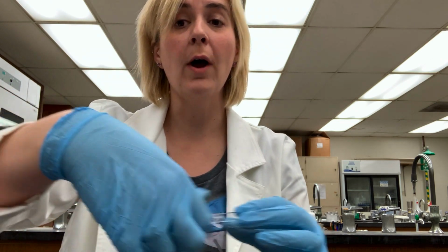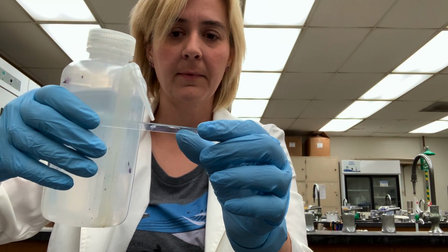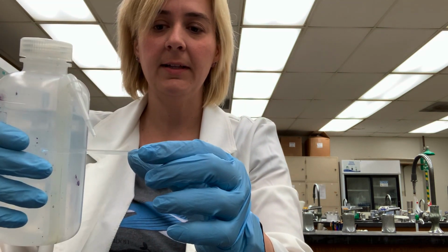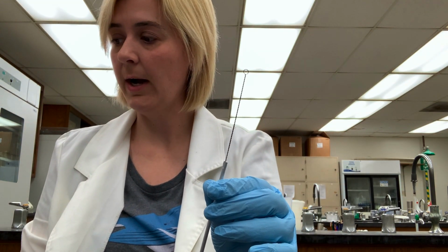So what we do when we're doing from the agar is we will take a clean glass slide again, and this time I'm going to add a drop of water onto the slide. Oops, too much water, so I'm going to dump some of that off. I just want a little drop of water on the slide. I'm going to set that down so I can re-sterilize my loop. Let it cool. It's a little too hot still.